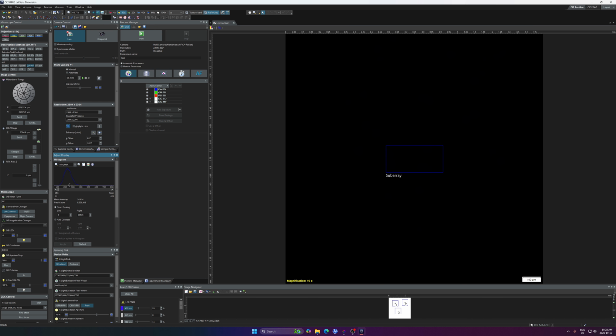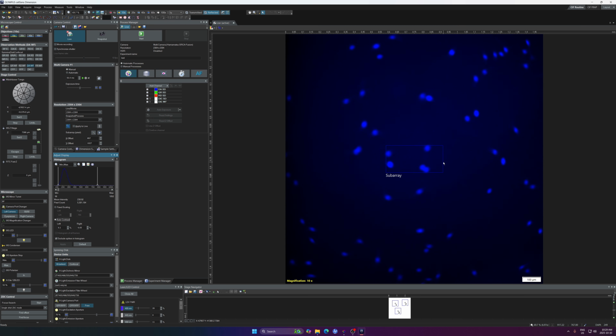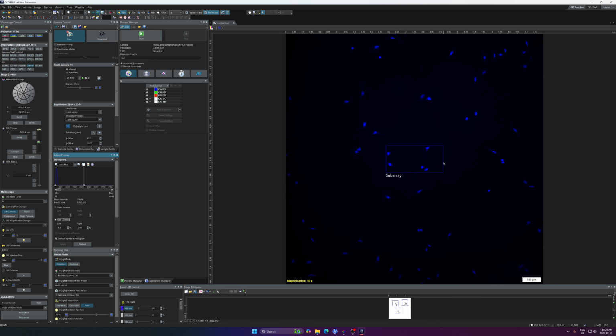Although it looks like the camera can image in different bit depths, when you drop down the options, your resulting image will always be in 16-bit and those settings only refer to the display. The minimum-maximum mode as well as the auto contrast function are very useful to find your sample initially. Once you have found a good range to visualize your sample, you can switch to fixed scale to be able to see differences in your staining. You should roughly aim for maximal intensity values in the 4000 range.